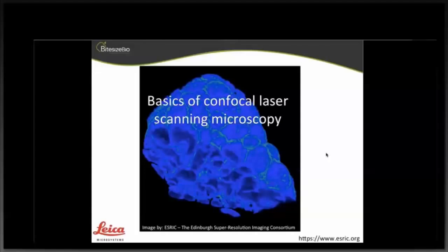Okay. Is there any issues with multicolour imaging, and is bleed-through a problem with this? Yes, it can be. On most, I'm sure on all confocals, there's the option to sequentially scan your image, because often green and red are the two that you use.